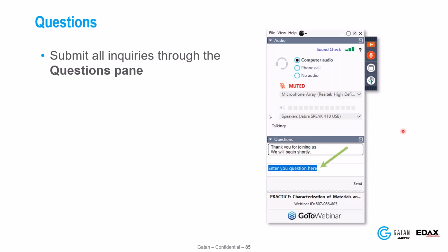There's a question, do you need to save the patterns to use the spherical indexing? Yes, you do need to save the patterns.